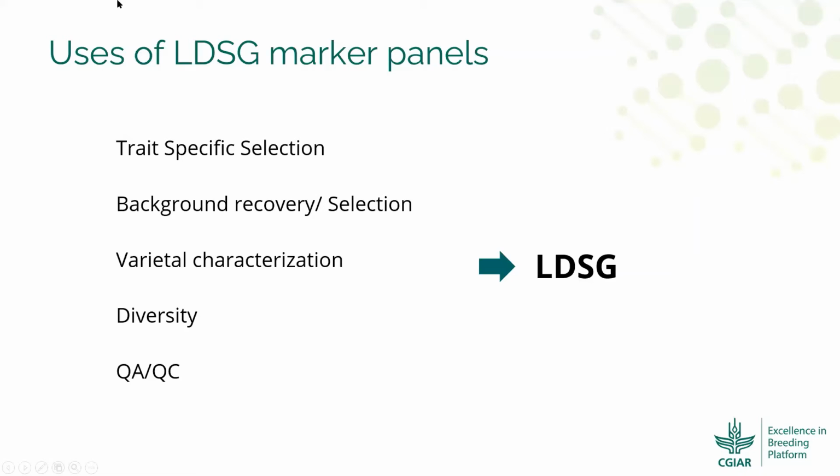In 2020, most of the centers started developing these QA markers, which are already available with the platform. This is also cost effective for fewer than 50 markers per sample. It is especially useful when considering the rapid turnaround needed, for example for selection in the RGA setup or seed increase for the purity test.